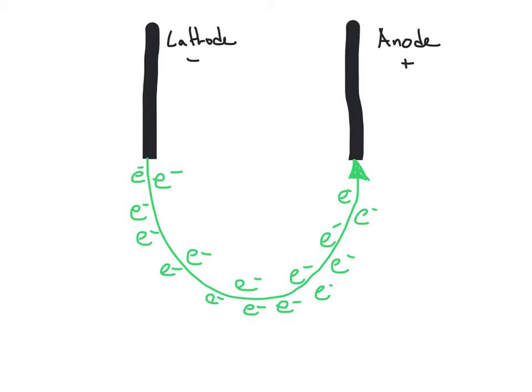What we saw was that there was a collection of copper forming, but it was solid copper. So around that graphite, we saw that copper. The reason for that: when the copper was still an ion, it had a positive charge, and it had some number of electrons.